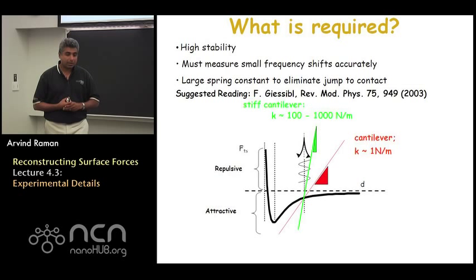Now, in today's lecture, we're going to take a step back from the theory that we've been developing to talk a little bit about some experimental aspects of FM-AFM. In particular, we've already talked about the phase lock loops and the different ways in which you actually implement the hardware and electronics needed for this. We haven't talked about the hardware and electronics in much detail, but hopefully in week 2 we went over some of the broad outlines of it. In the appendix of this lecture, we've tried to introduce again some more information on phase lock loops, and you're welcome to look at those.